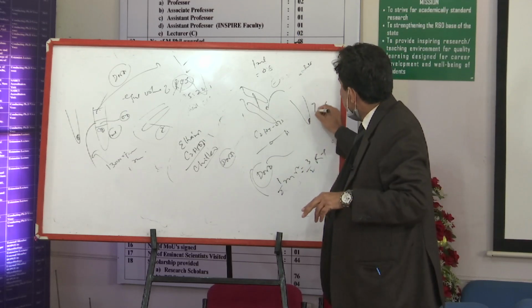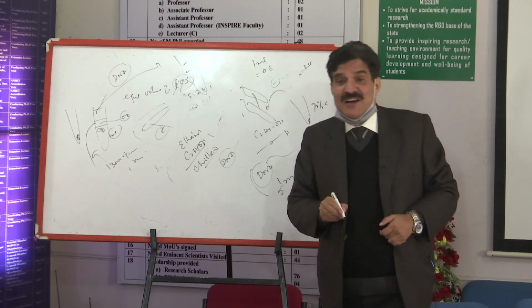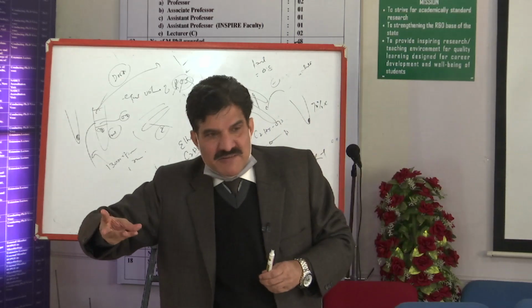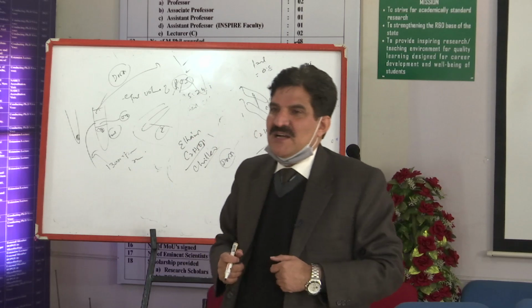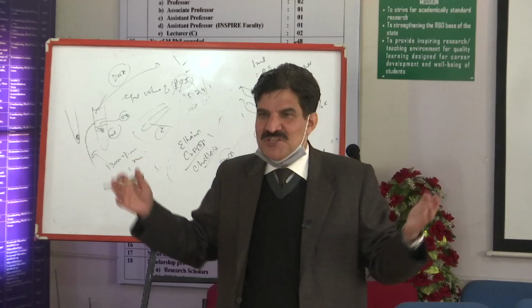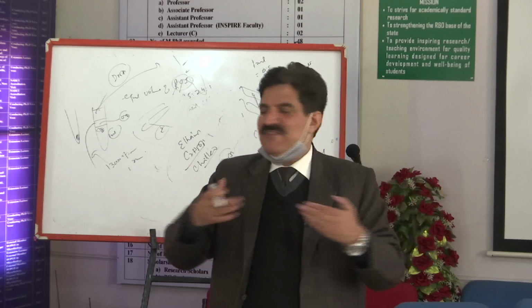Then you are adding 70% alcohol. That is why we wash with 70% alcohol. 70% means 70-30. 70 of alcohol, 30 of water. Did you understand? Theoretically, actually we do not prepare it like this. People from chemistry must be knowing this thing. Actually we do not prepare a solution by saying add 70 and add 30.